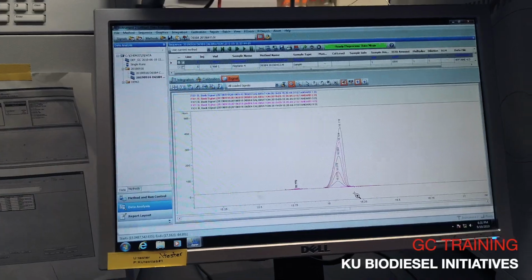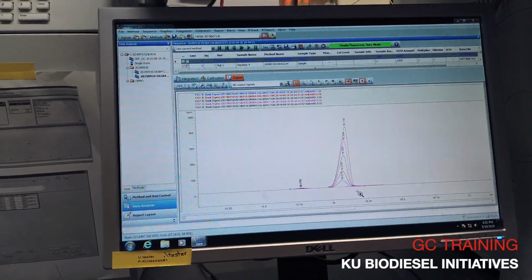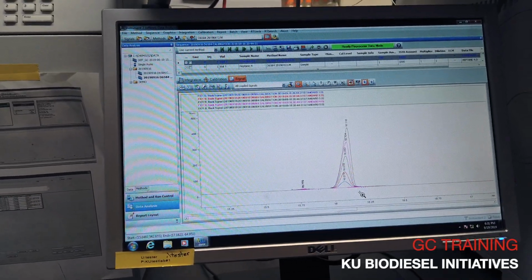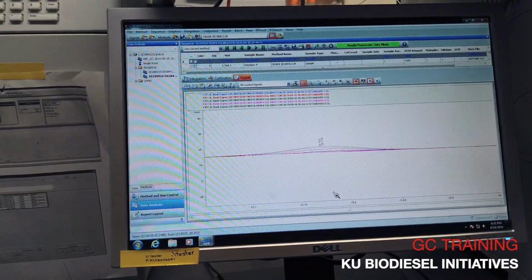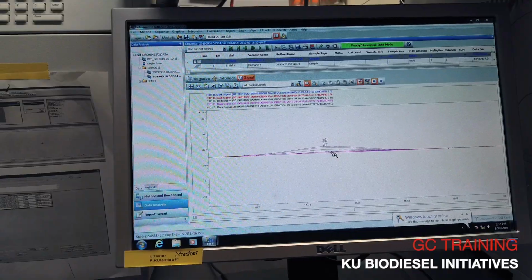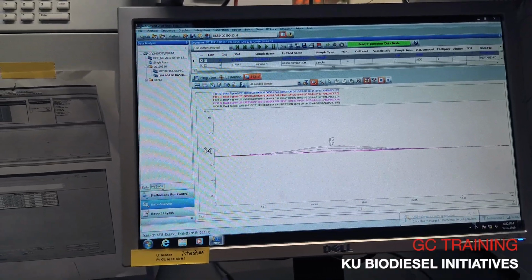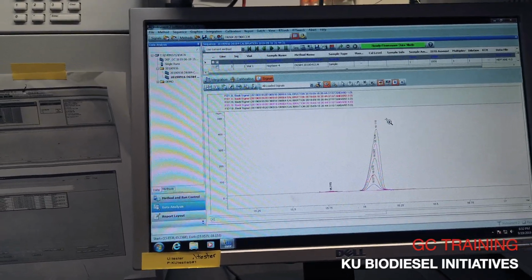Technically speaking, since these are new calibration standards, you should only see 1 peak. But if they're a little older and they've been sitting for a while, then it's possible that you'll get degradation products. So you just want to look at this and see whether it's growing or not. This is really negligible because it's literally like 20 units high. So we're going to try to just do this.